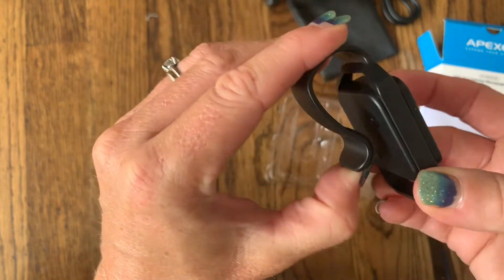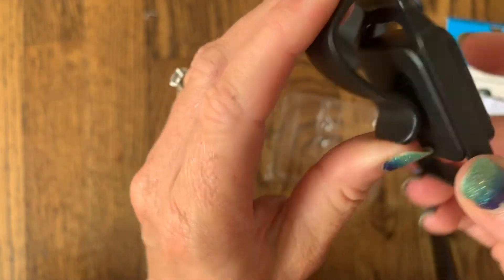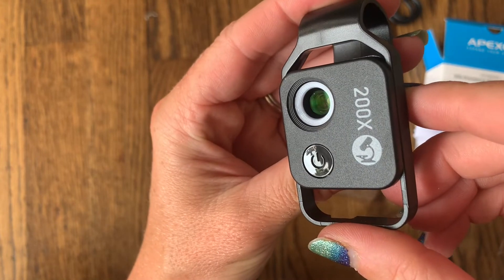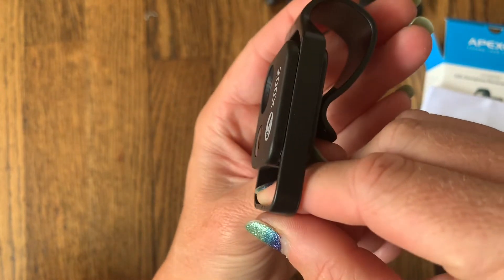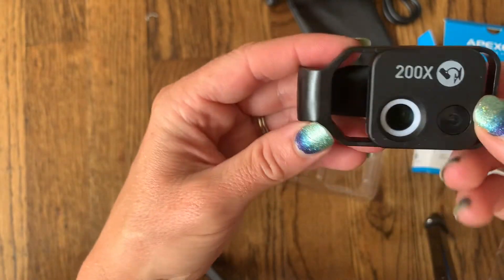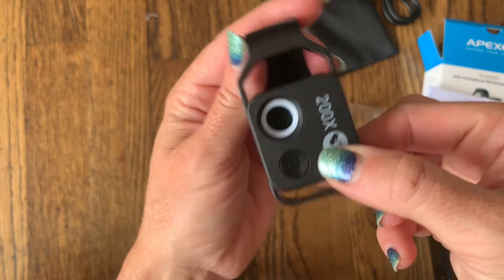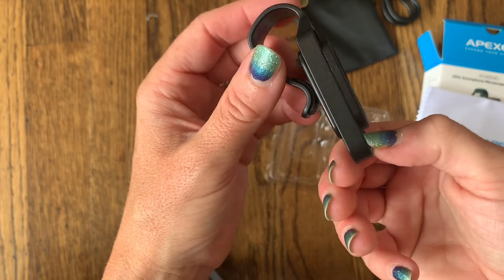Here is this personal-sized microscope — it's nice and small. It has a flexible clip, so all you need to do is clip it on and get it lined up with your phone. You can see that little hole right there — that's what lines up with the back of your phone camera. This button on the front adjusts the brightness, and it can slide up and down to really get the exact view you want. It's so adjustable that you're going to have absolutely no problem.